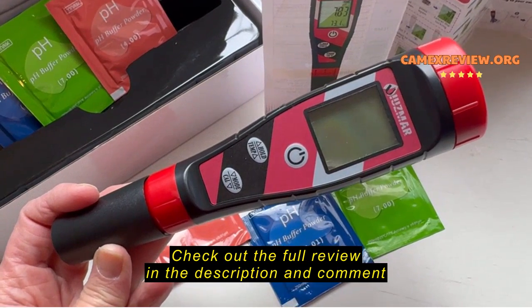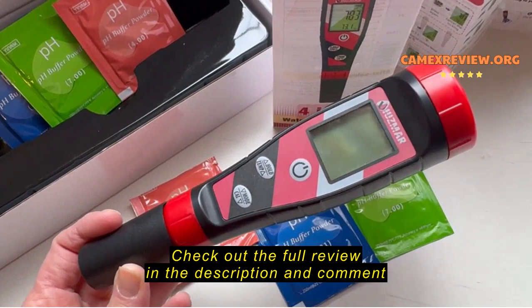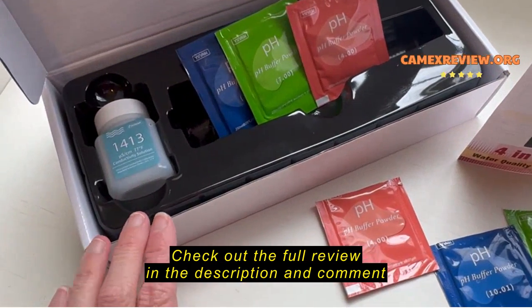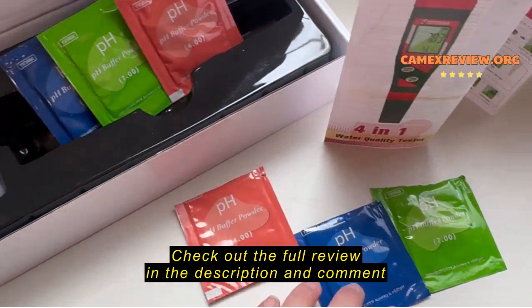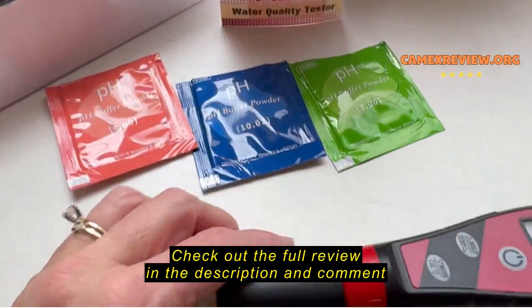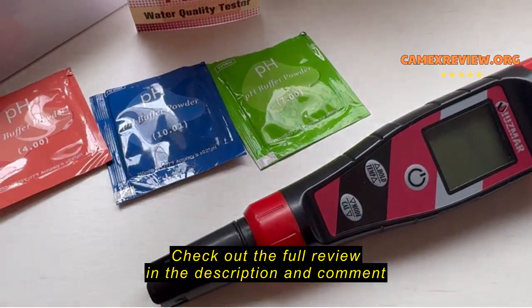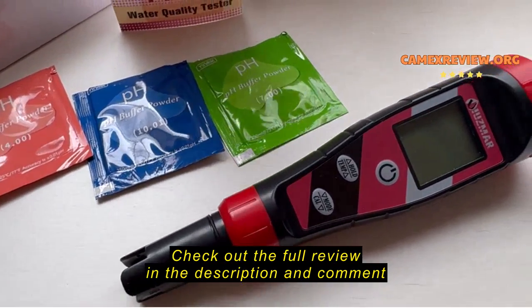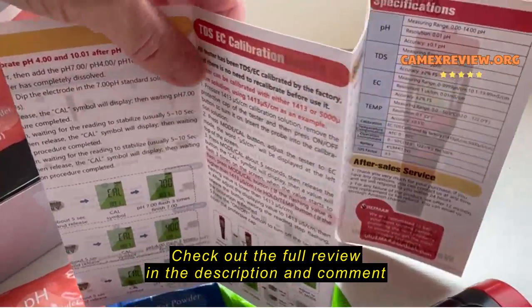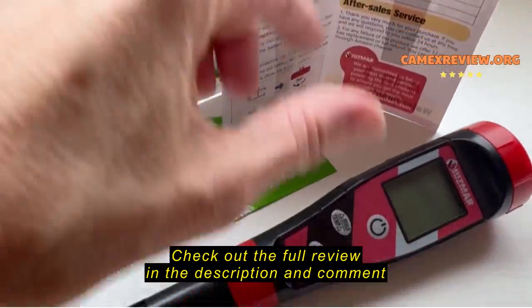This is my review of the IUSMAR pH and water testing device. It comes with everything you see here, including some conductivity solution and several buffering powders to calibrate the device. It will measure the pH as well as TDS and EC levels of your water, and it even shows you the temperature of the water.